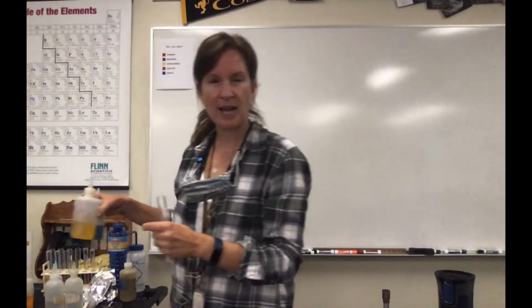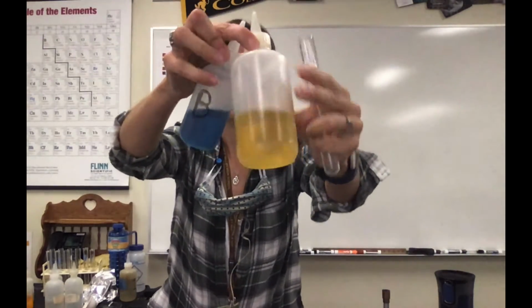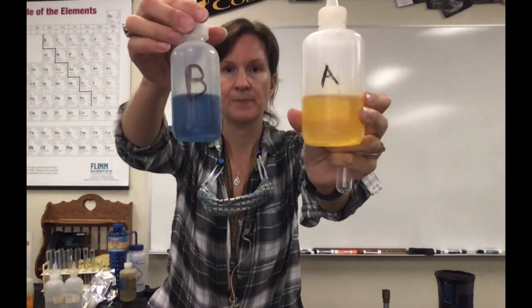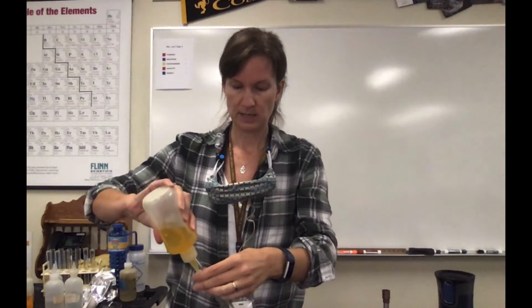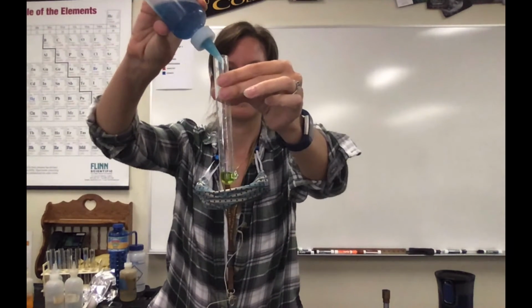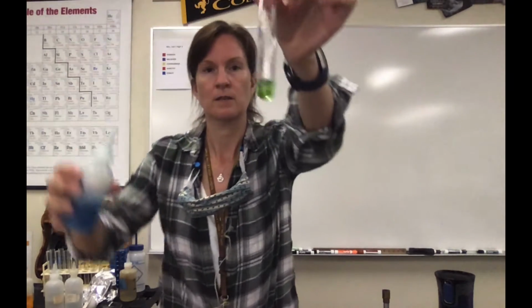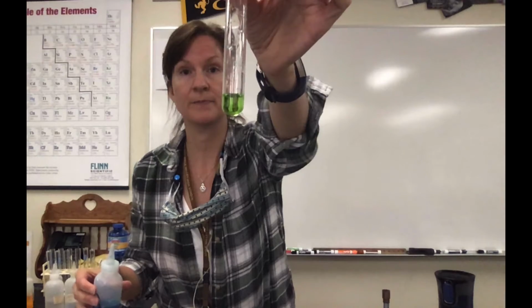Experiment number 5 is an A and B solution that I'll mix. So here is A, here is B. So you can see them beforehand. And then during and after. Make observations of that new material, chemical or physical, and why.